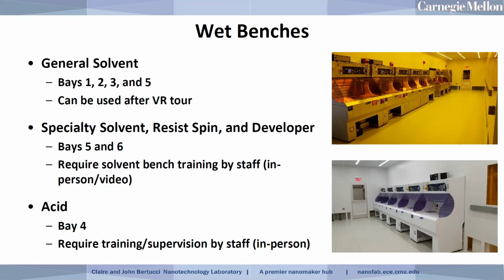The next category of benches include specialty solvent, resist spinners, and developer benches. So these are located in bays 5 and 6, and the operation of these benches is a little more involved, and there's a lot of bells and whistles with these benches. So for that reason, we require solvent bench training by staff members, which can be done in person or through a virtual format with a video.